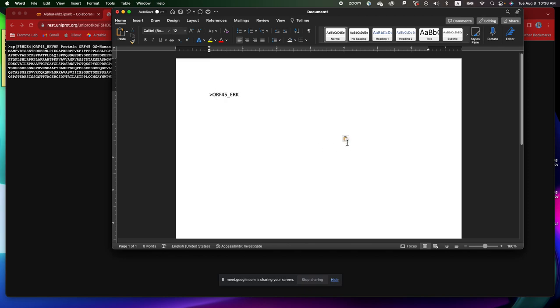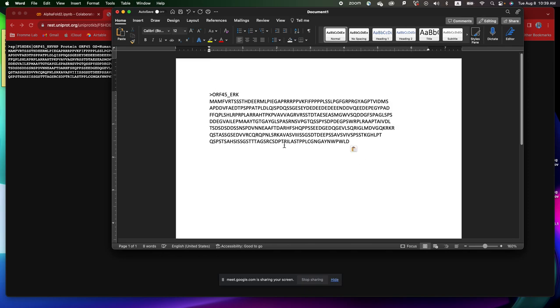So paste the sequence of the first protein, then get rid of any spaces, like what I'm doing here. Perfect. And then you're going to put a colon, and this colon separates the two protein sequences of the two separate monomers that you're trying to create a complex with.